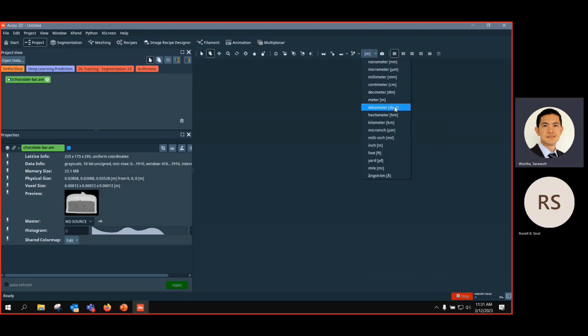Because, for example, during the work, you cannot change the working unit, but you can change the display unit. So it's two different ways. But that gets confusing because sometimes your working unit is fixed. For example, if you have micrometer, your working unit will be in micrometer, but you can change the display to anything you want. You can change to nanometer like this. And once you calculate it, everything on display will be in nanometer, but your actual calculation is in micrometer.